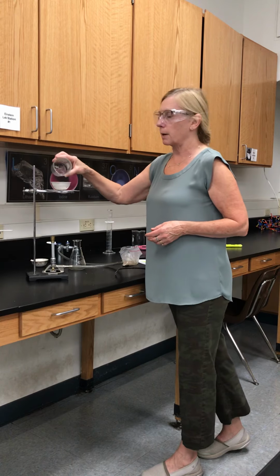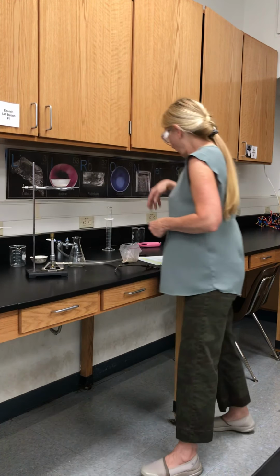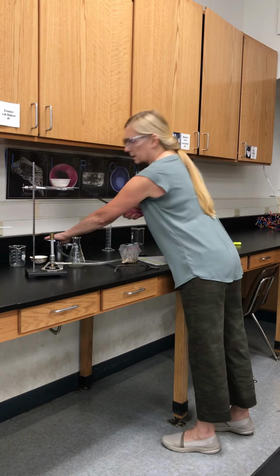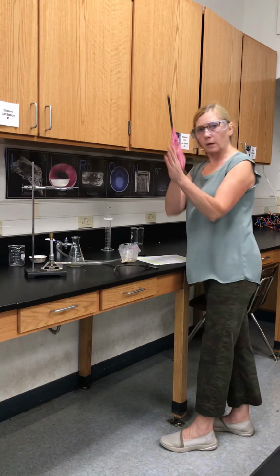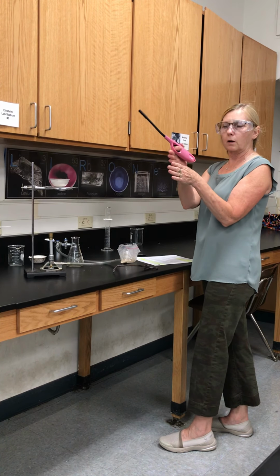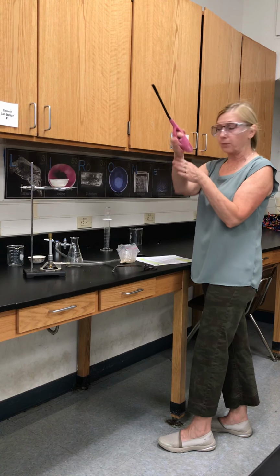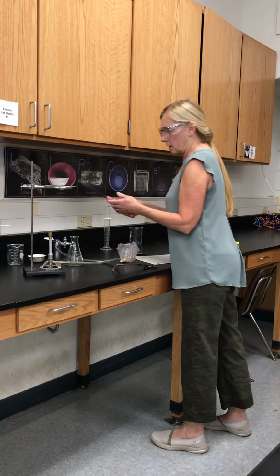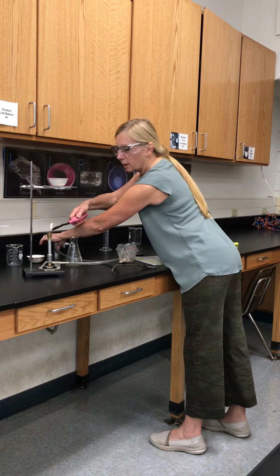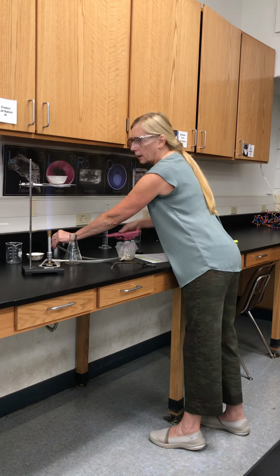We'll examine what our leftovers are in a few minutes. So then we're going to turn on our Bunsen burner. Remember, when the handle and the spigot are straight, that's when it's open. It can go right through the gate. So I'm going to get my fire ready, turn on the flame, and get this ready to go.